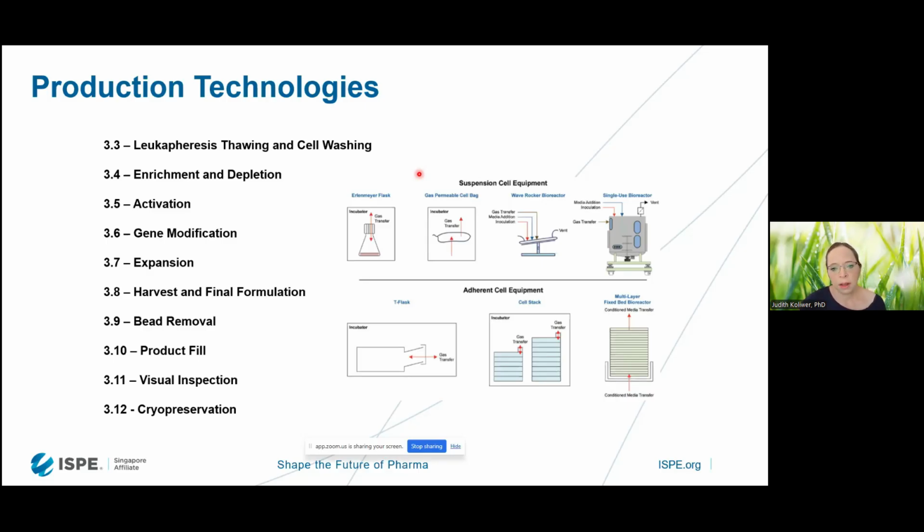This is the first step that we usually see if we are going for an automatic or semi-automatic cell processor, that this could be done using one of the modules, so that we basically already feed our cells. Maybe taking this example here, if this is our cell chamber with a stirring tank, and we add our cells into our bioreactor, we could actually add our activation ingredients using one of the ports.